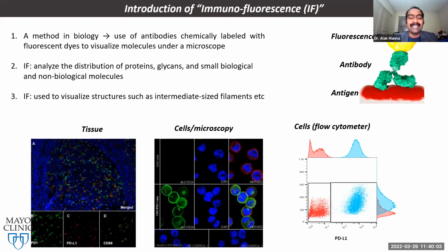B.C. Das was mentioning that in our childhood everybody sees the fireflies and everything, but immunofluorescence is a little bit different than that.